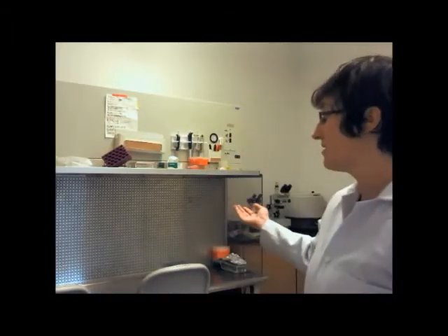I'm going to talk to you about moss development on Tuesday. We'll be working in this room, which is our sterile culture room. Here is our sterile hood. It's where we culture moss so that it isn't contaminated with bacteria or fungi.